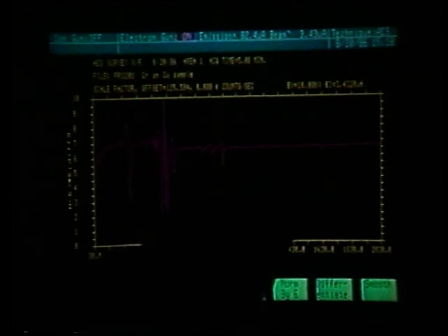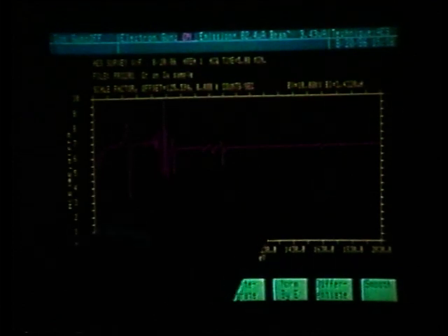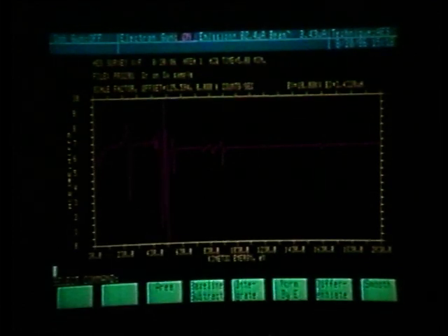We're not sure about silicon. If that's a contamination, it might be only on the surface in small amounts, or it's possible that it's a contamination all the way through. In either case, we probably want to be sensitive to silicon, thus meaning we need to go several sweeps on the silicon peak.